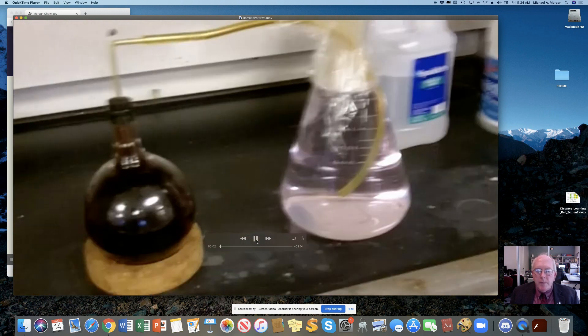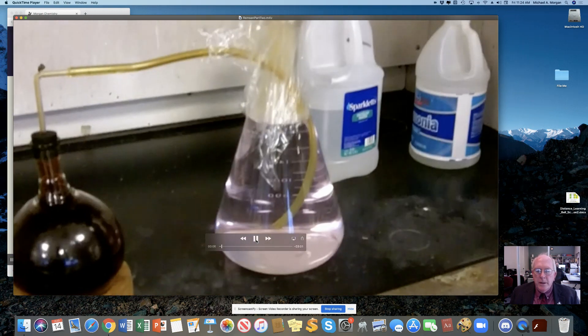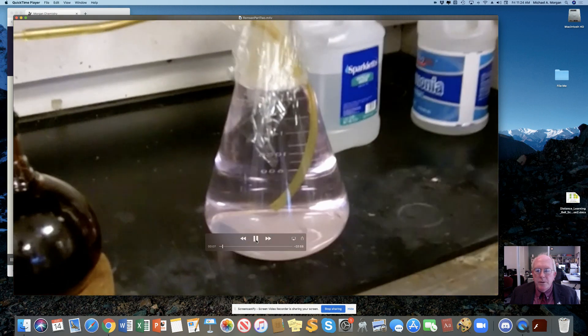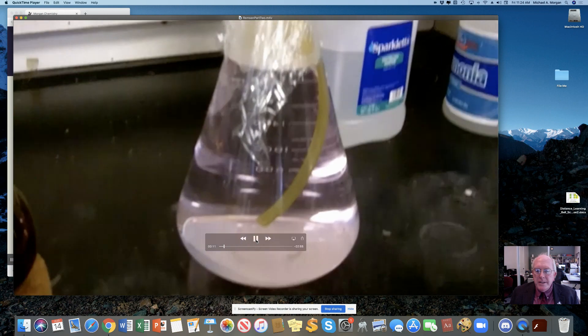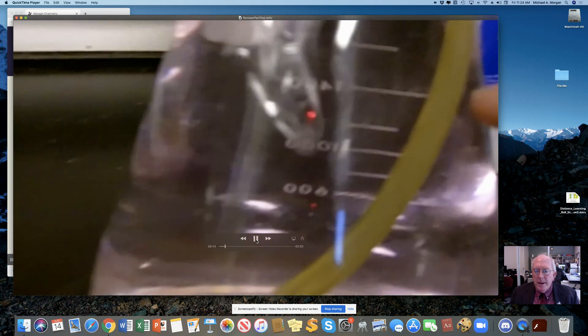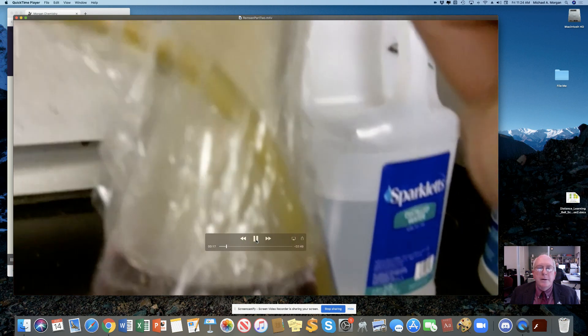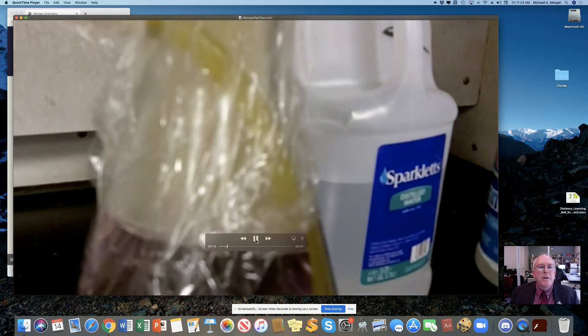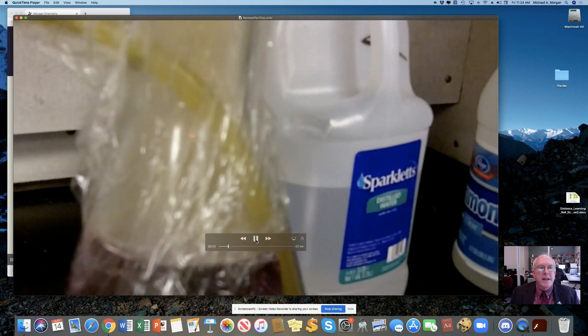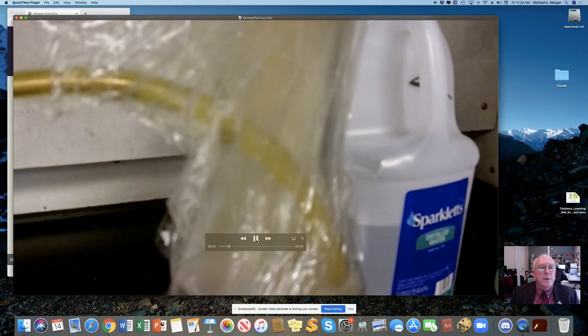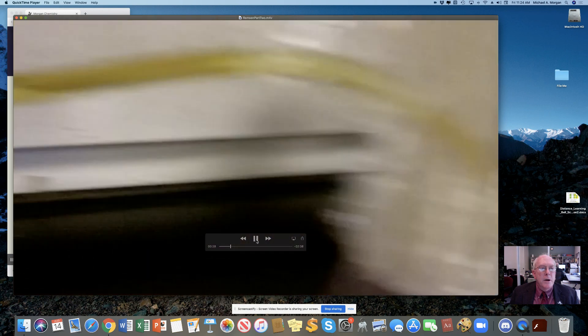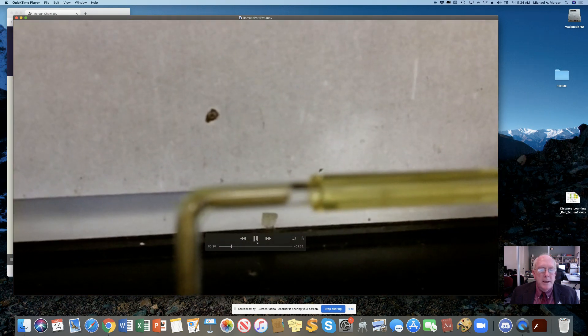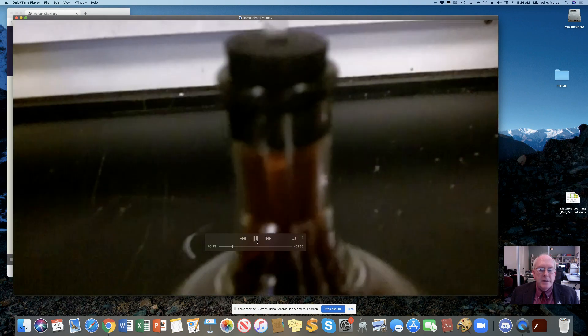So, it's cooled off. And if you look inside of that tube, which is a little darker than the background, that kind of brownish plastic tube, you can see liquid is moving up inside that tube, if you follow my finger. And you're going to see it coming over there at the top left of the screen. You can see that little brown moving, showing really well right there.